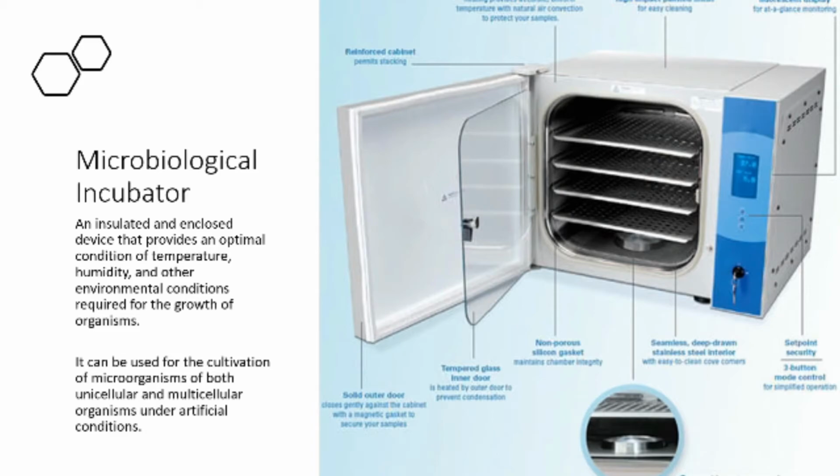Microbiological incubator, or the cell culture incubator, is an insulated and closed device that provides an optimal condition of temperature, humidity, and other environmental conditions required for the growth of organisms. They are widely used for culturing of cells, both eukaryotic and prokaryotic.